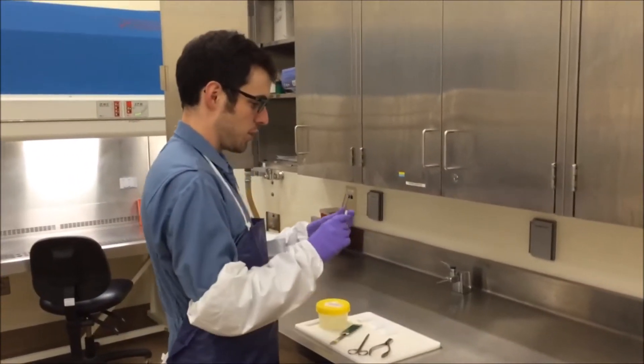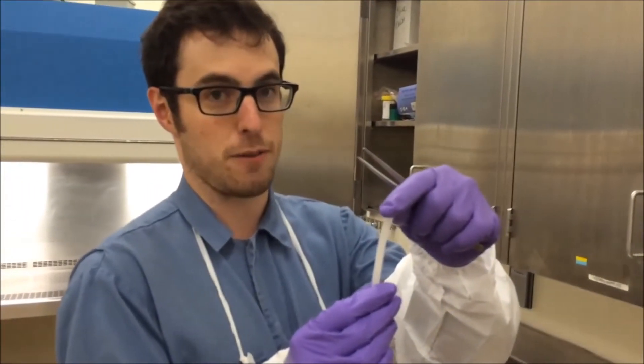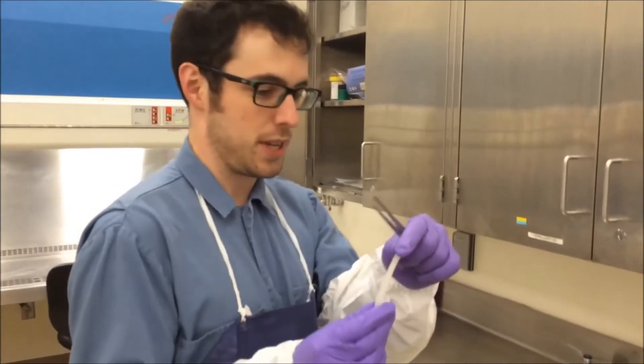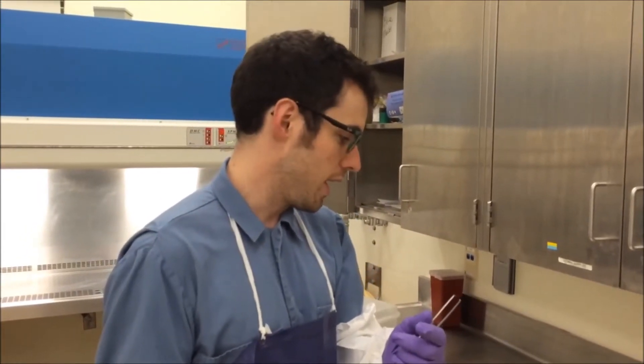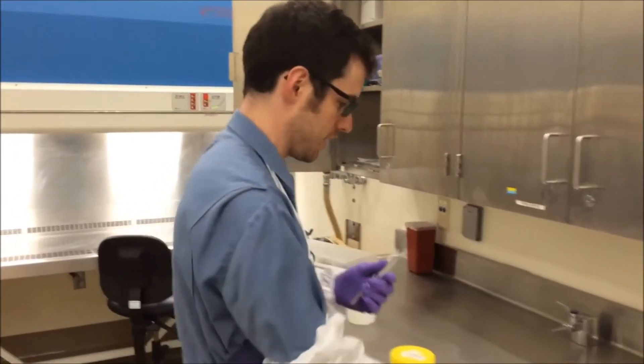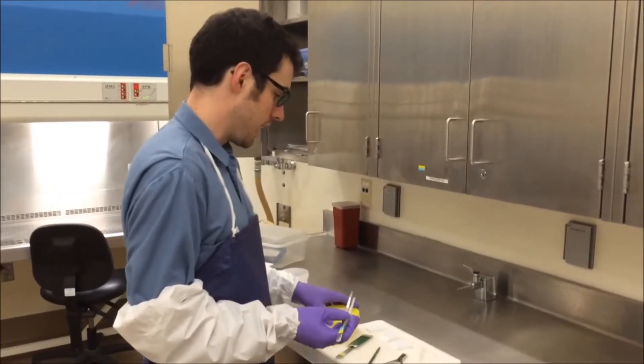And we also use these thin strips of paraffin wax. What we do with these is we roll up wings with this so we're able to trim them in and look for evidence of inflammation in the skin or any signs of white-nose syndrome.